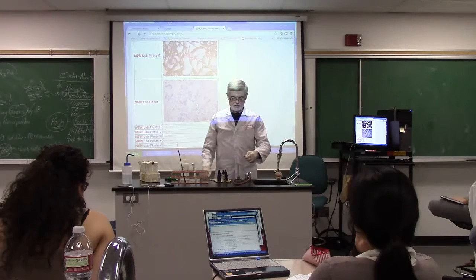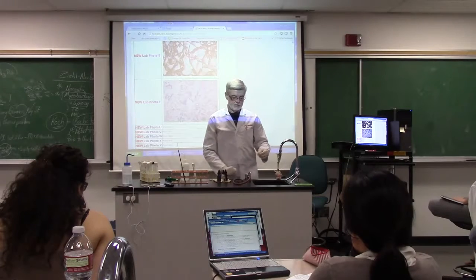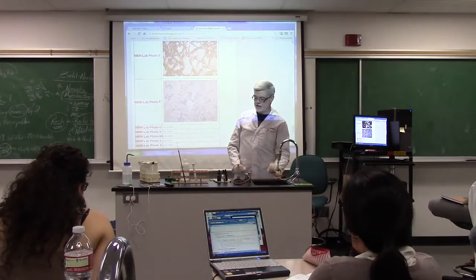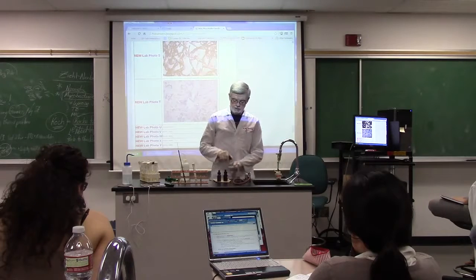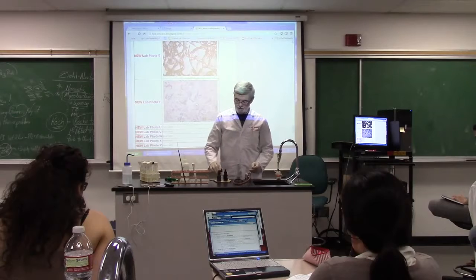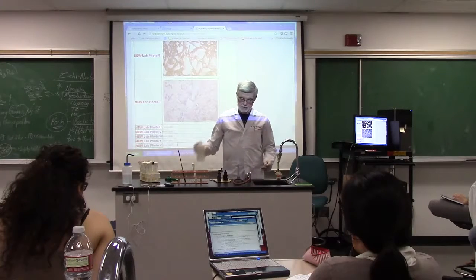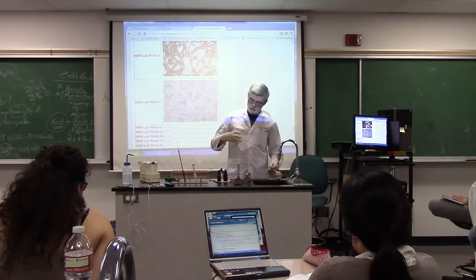Just watching the edges. We are gently raising the temperature of the carbolfuchsin, and now it's beginning to withdraw. So after it begins to withdraw, we're going to shake it off. We're going to get this acid alcohol, half a dropper full, ready to go. Get our water ready to go.